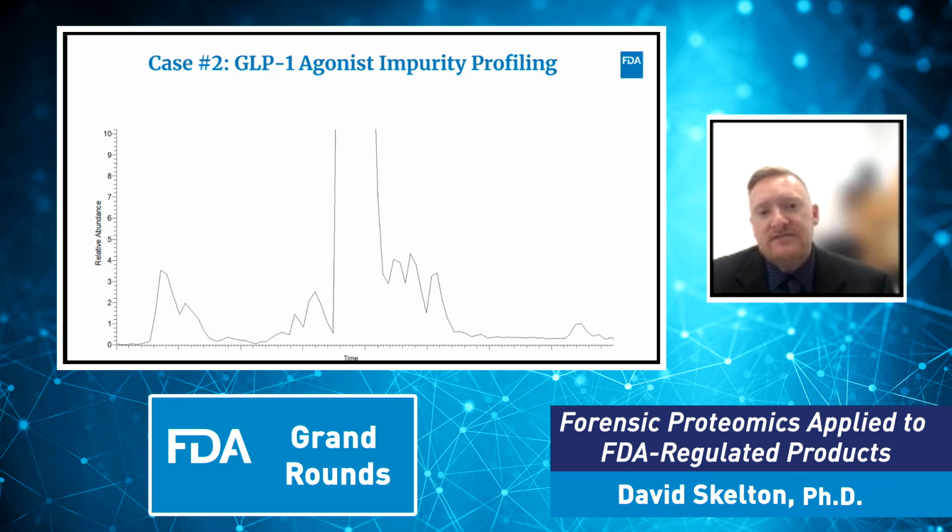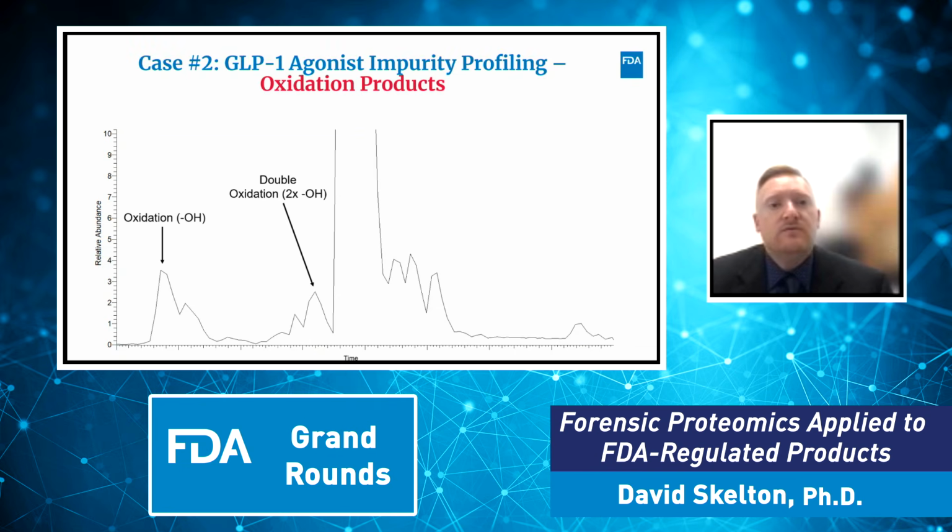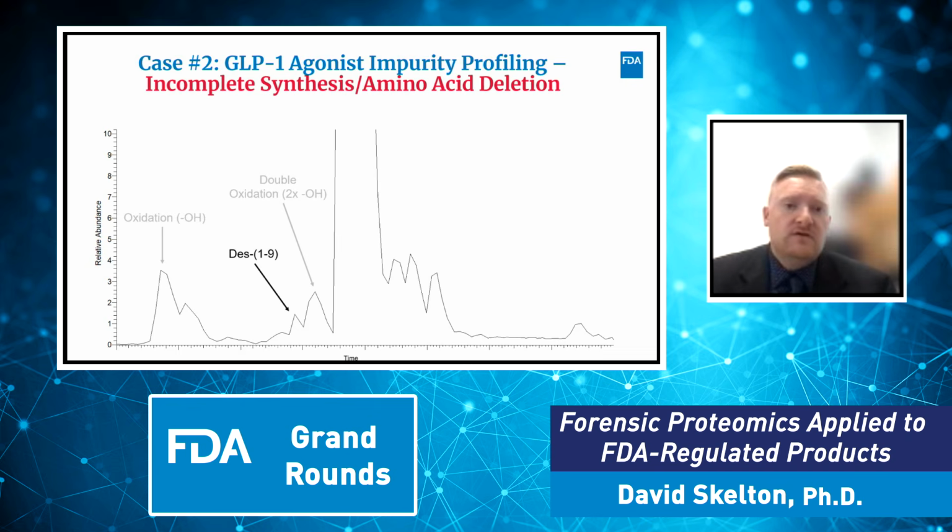Applying the same techniques that we have been using, we were able to identify oxidation products. So these are amino acids that have been oxidized at specific locations in the GLP-1 sequence. This Des 1 through 9 is proteomic nomenclature that indicates that the first 9 amino acids on the N-terminus side of the GLP-1 agonist were missing. So this could either be a result of an incomplete synthesis, or it could be a breakdown product.